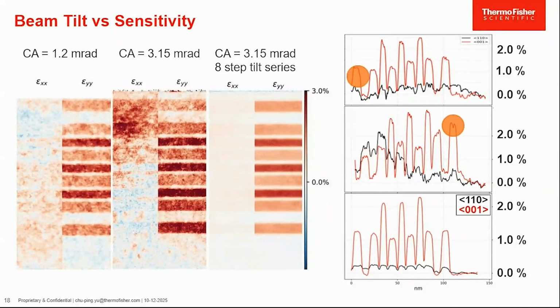I'm also very happy to see that the strain in the X direction can be much nicer mapped out in the final case with the frame-based precession. And this is almost impossible in the 2 cases before, where the background noise is so high, it's hiding the strain level in the 110 direction for both measurements.